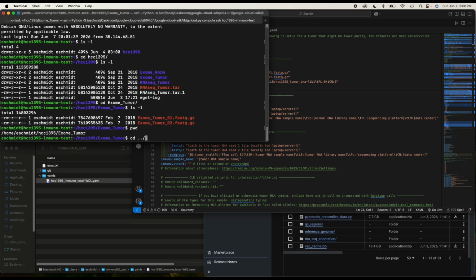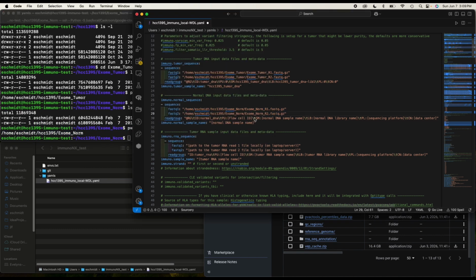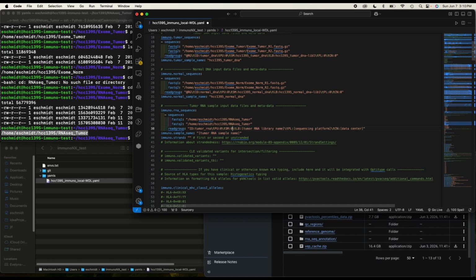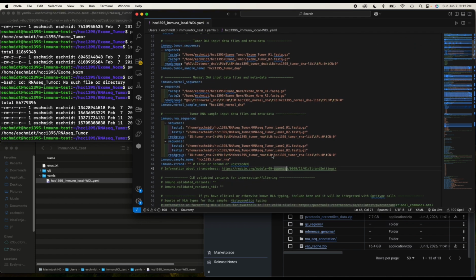Okay, now let's do the normal sequence. Okay, so that's how you set it up.